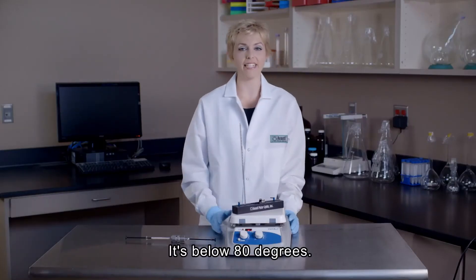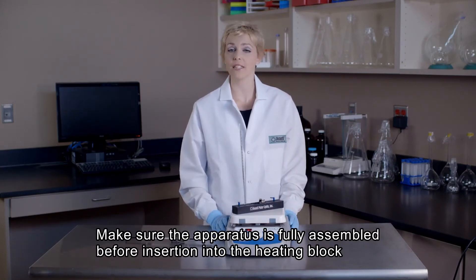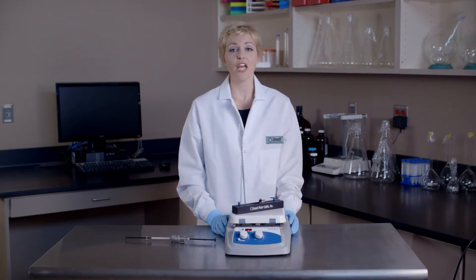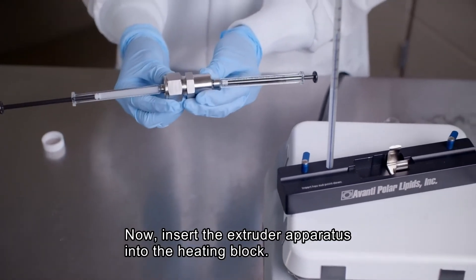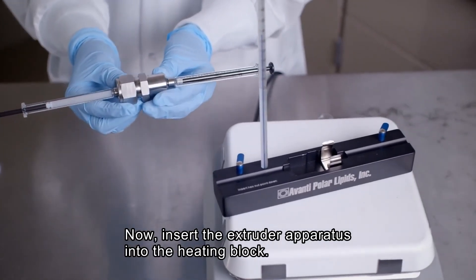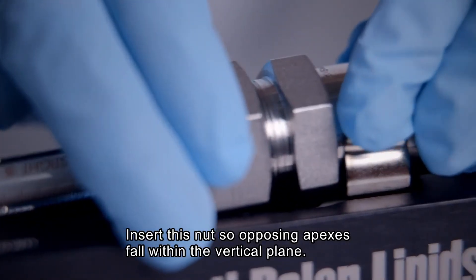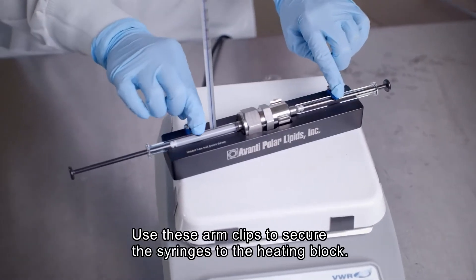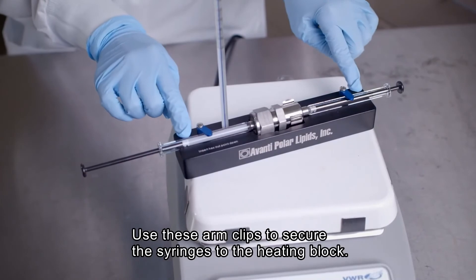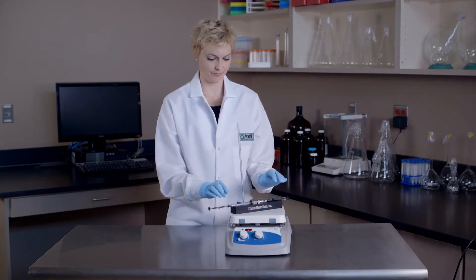Looks like we're below 80 degrees. And now for the most important note: the extruder apparatus must be fully assembled prior to insertion into the heating block in order to prevent damage. Now we're ready to insert our fully assembled extruder apparatus into the heating block. Insert the hex nut so that any two opposing apexes fall within the vertical plane. Then use the swinging arm clips to secure the syringes into good thermal contact with the heating block. Allow the lipid suspension to equilibrate to the temperature of the heating block for approximately 5 to 10 minutes.